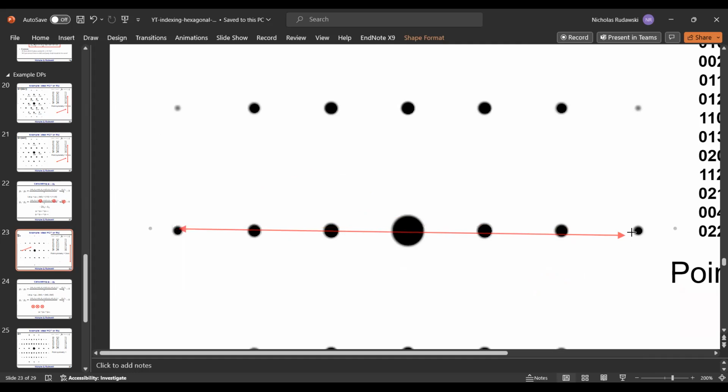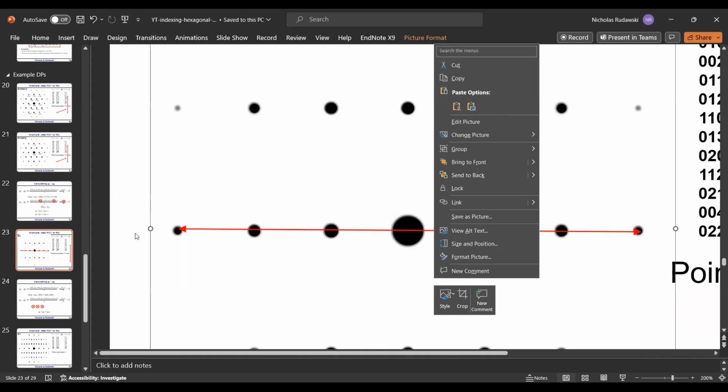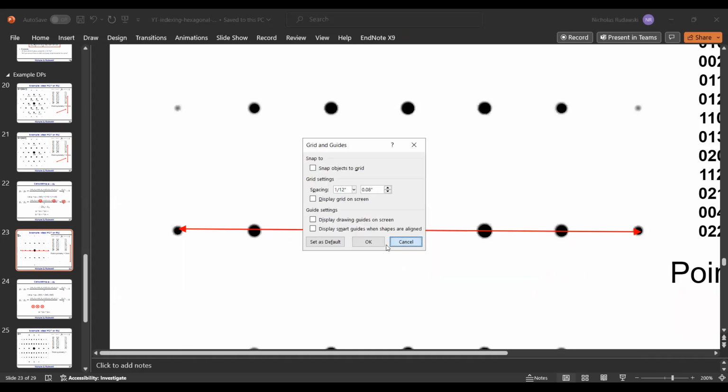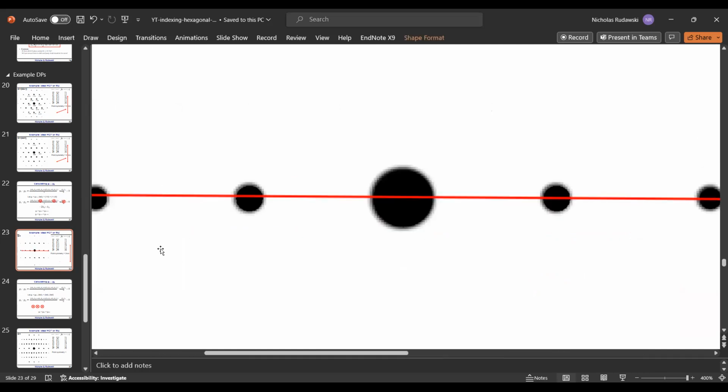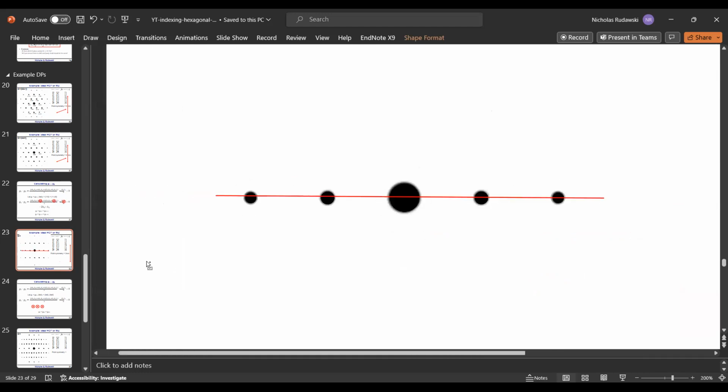It's not letting me. Do I have something like, do I have this on? No, I don't. I don't know what that is. I'm trying to get this to constrain to be.